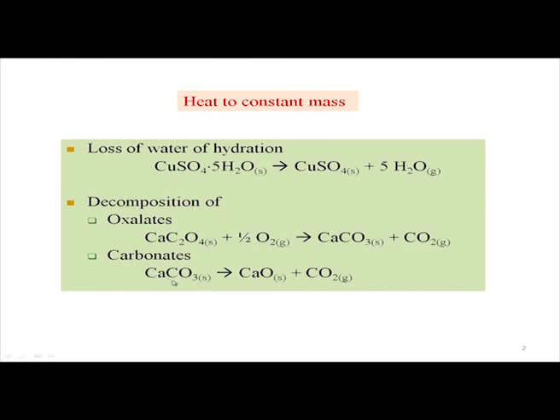Sometimes it can give rise to the basic carbonates, that means hydroxycarbonates, like copper hydroxycarbonates, and like magnesium oxalate, several other salts are also known. So, all these metal ions can be analyzed by getting either their corresponding oxalate salt or their corresponding carbonate salt.